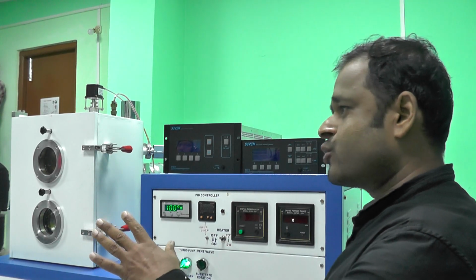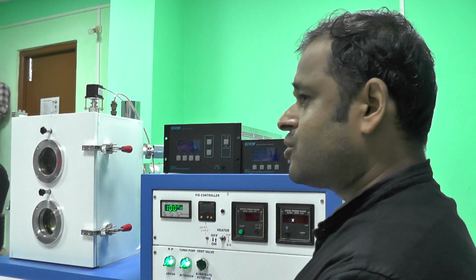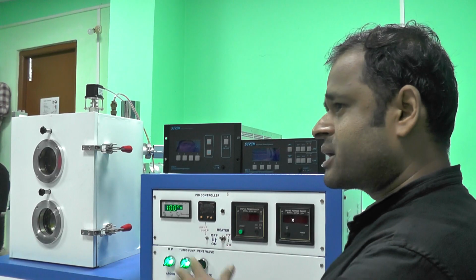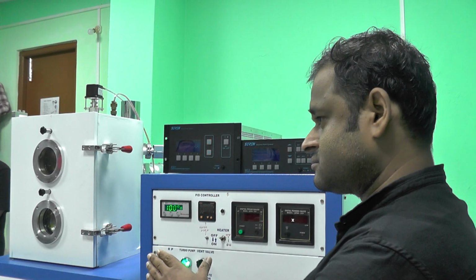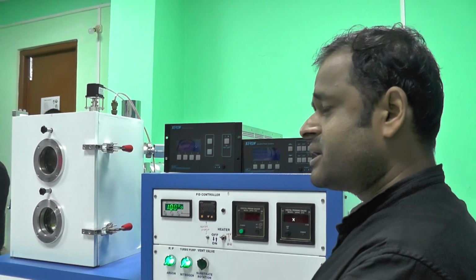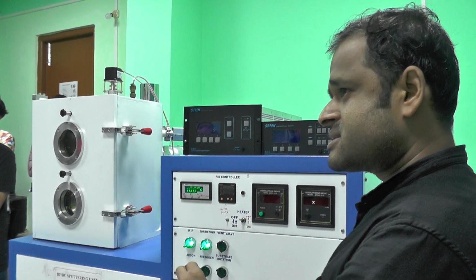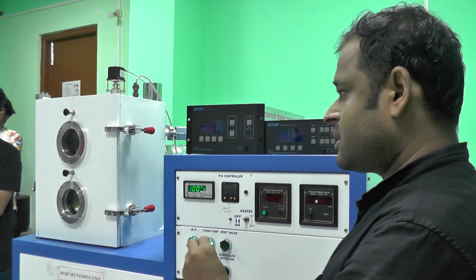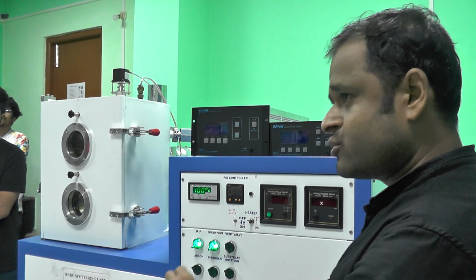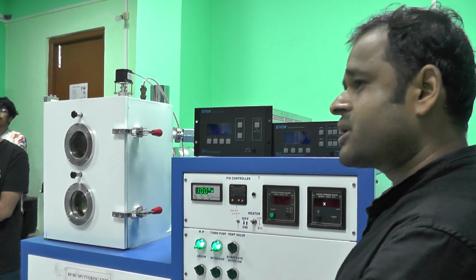So I would like to brief about sputtering. Sputtering is a PVD technique, a physical vapor deposition technique. It is industrially well established, low cost, and easy to use, as compared to other chemical strategies.